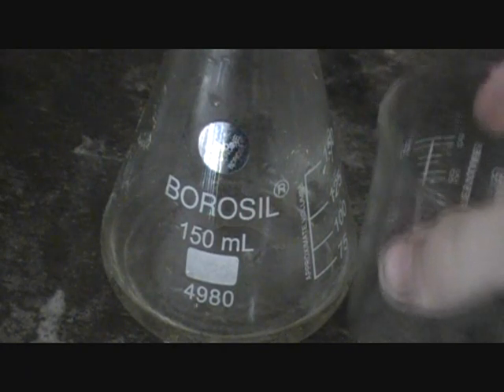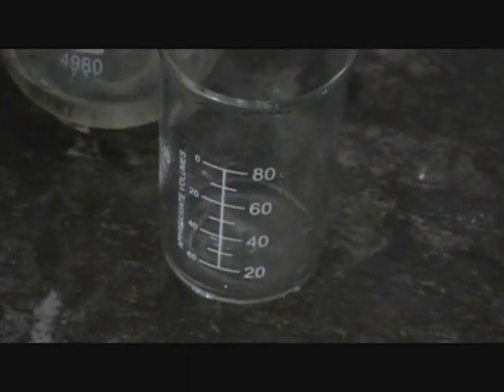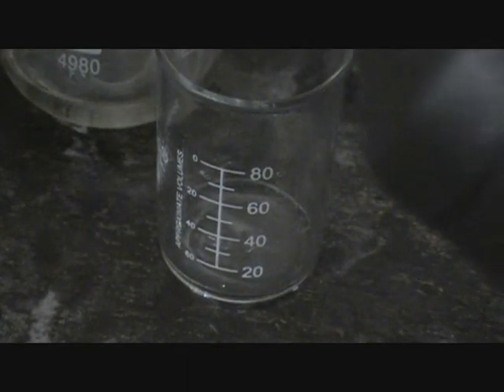I know I have more beakers, but I'll still — and then pour in 20 milliliters of hydrogen peroxide.